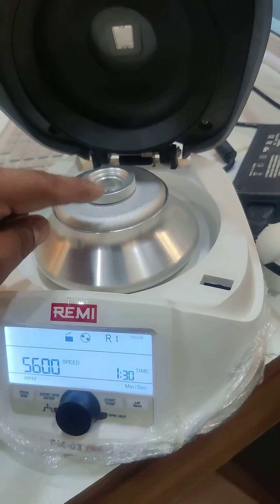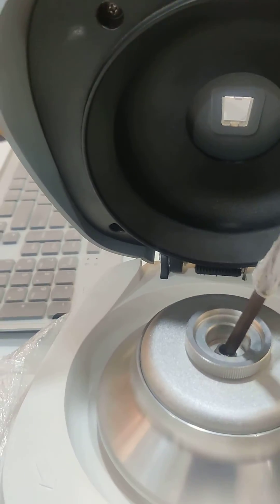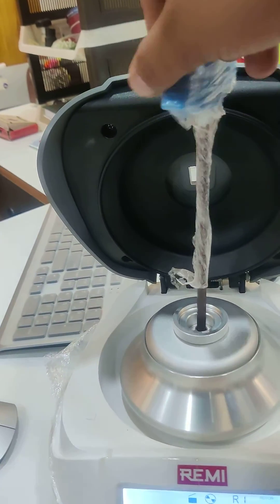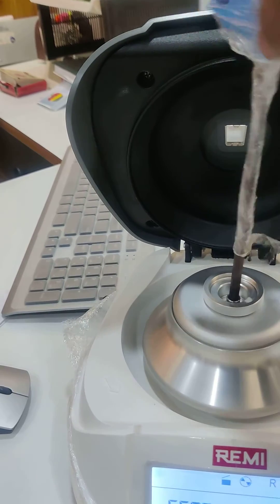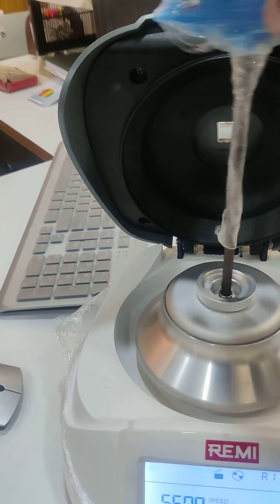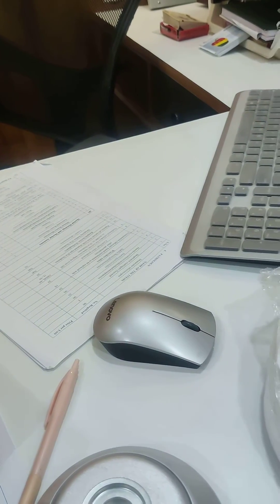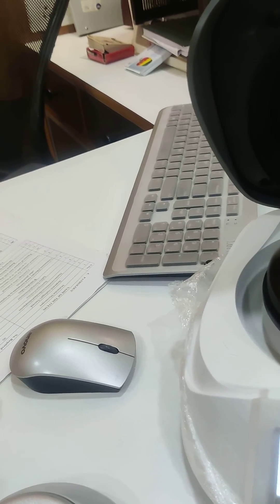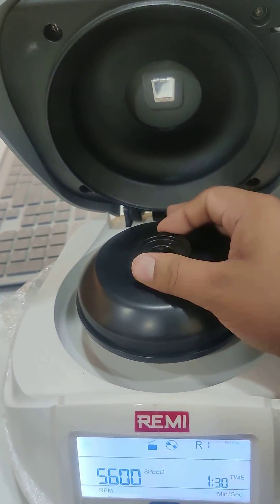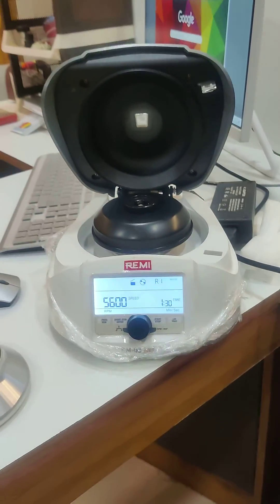The lid will open. There are two heads in this machine. To change the head, take the tool that comes along with the machine and rotate it. Then place the other head and mount it tightly. Take the tool again and tighten it up. That is how you change the head.